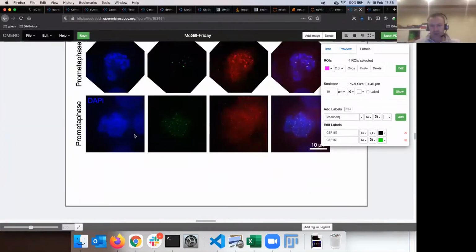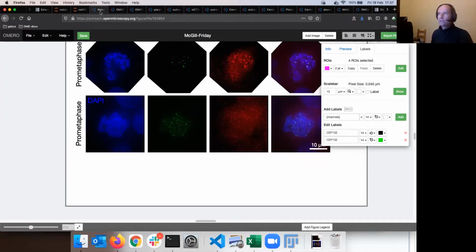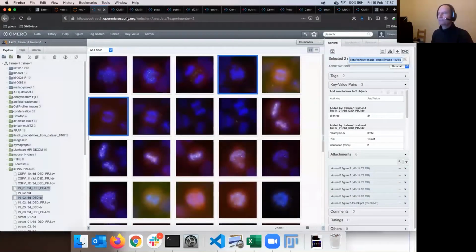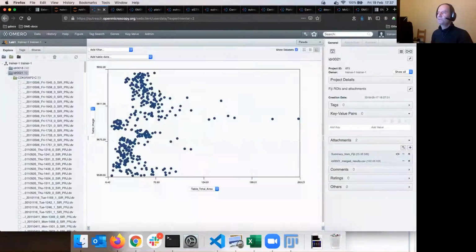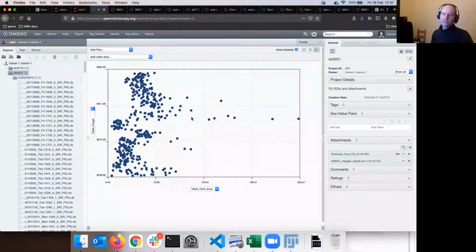At the moment, for the plotting, the graphs have to be saved as images. That's something that comes up quite often. We've not implemented that feature yet. As Peter said, one of the figures was the Western blot, and they are saved as PNG. That's the only way at the moment. So can we save the plots in OMERO.parade as an image? Plots, not data. That's a very, very often asked question. So I think what you are asking is, let's say we have a plot in OMERO.parade like so, this plot, and you would like to right-click and say save as an image in OMERO. A very valid feature request, but not there yet.